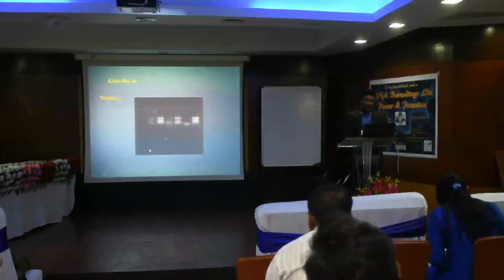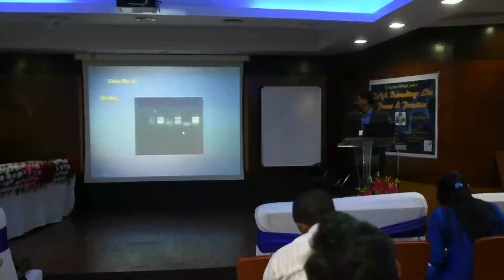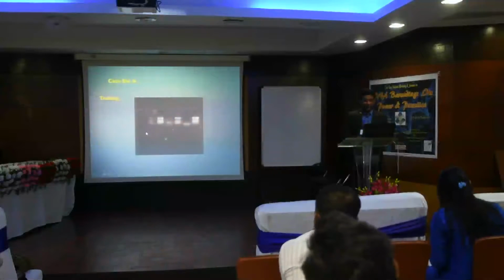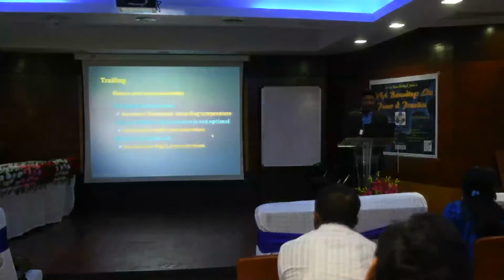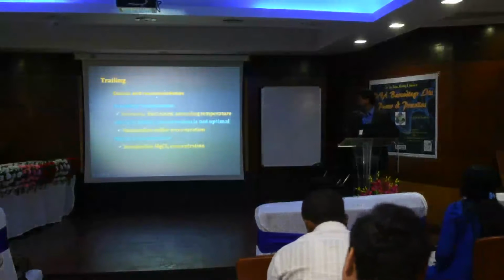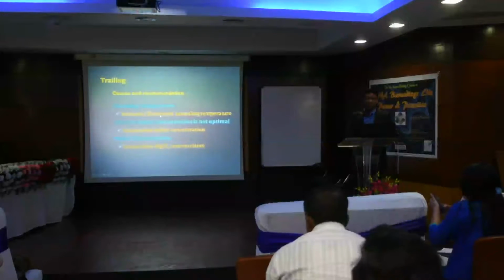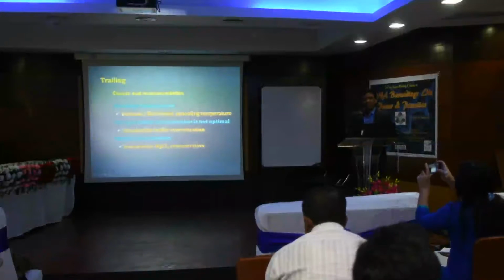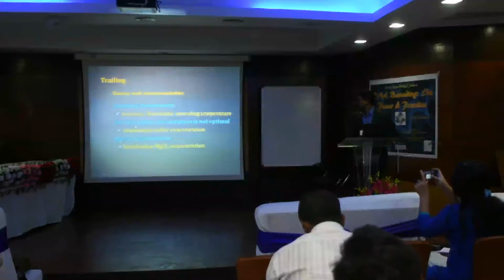And then the sixth case is smearing, such type of poor presentation you will have. Very commonly apparent in most labs. So these templates are of no use in downstream applications. In this case, usually the annealing temperature needs to be increased or decreased sometimes. Then usually increasing is essential. Then the 10x PCR buffer concentration is not optimal.